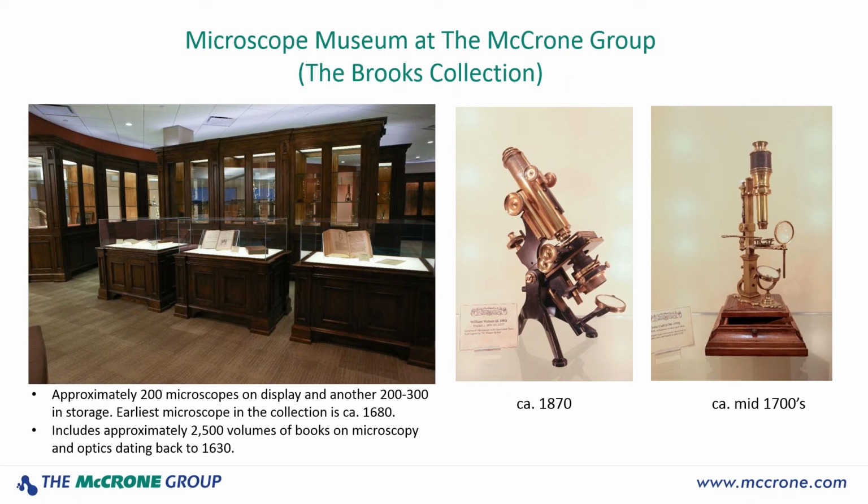On the right-hand side here, we have a couple of microscopes from his collection. One's from circa 1870, and the other one from the mid-1700s. These are fully functional microscopes still after several hundred years. You notice on the circa 1870 microscope, those of you that have compound microscopes will probably recognize the substage condenser that's right below the stage and above the little mirror. That condenser still looks very similar on today's microscopes, almost 200 years later.